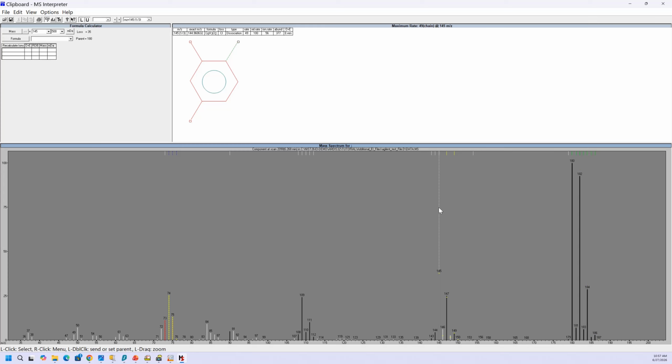So I've shown you two different ways. There's a lot of things you can do with structures, but in general, you can send any structure that you could find in the library search over to ACD, modify it, or do whatever you want to, and then bring it back. And then you can search by structure. You can search by exact structure. It gets rid of some possibilities using the InChIKey, but be sure to change that back when you get through with it.